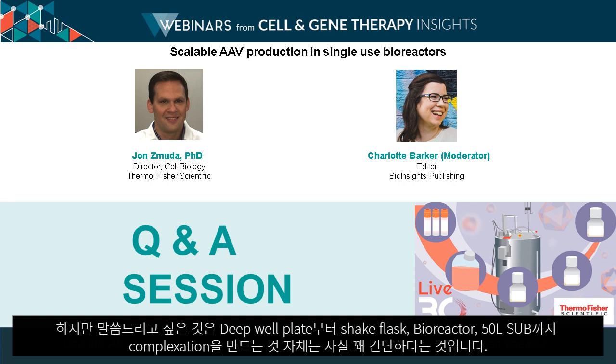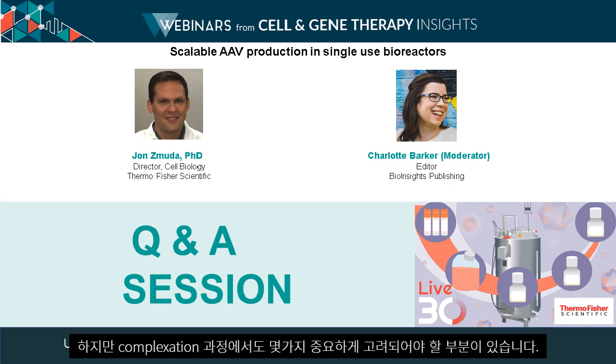all the way from very small scales in terms of deep well plates to shake flasks to wave bioreactors that we didn't show in the data today, all the way up to the 50 liter and in fact ongoing studies, even larger stirred tank volumes. So one has to just keep in mind a couple of key steps in that process.